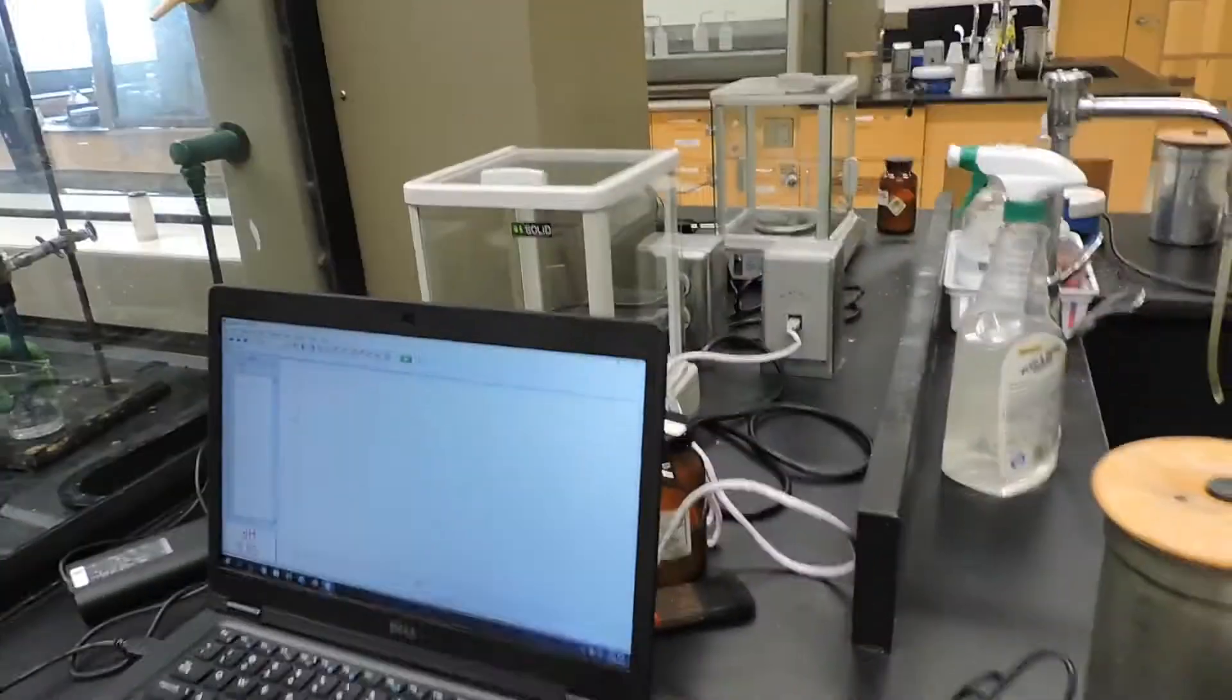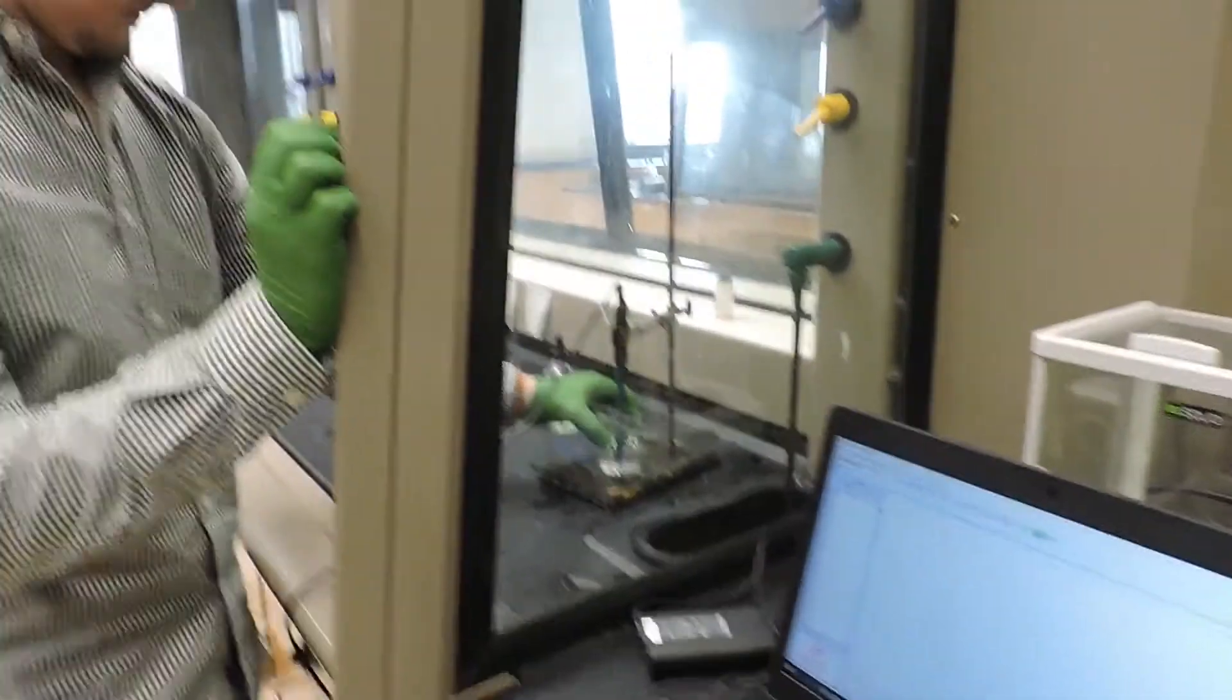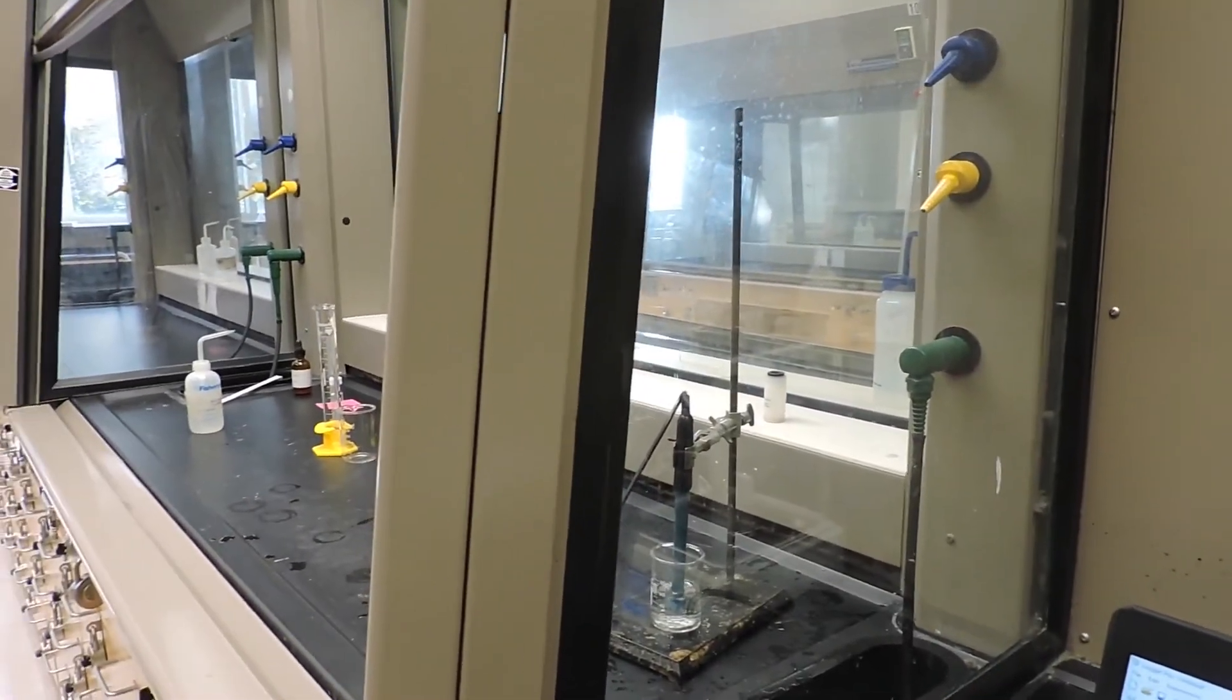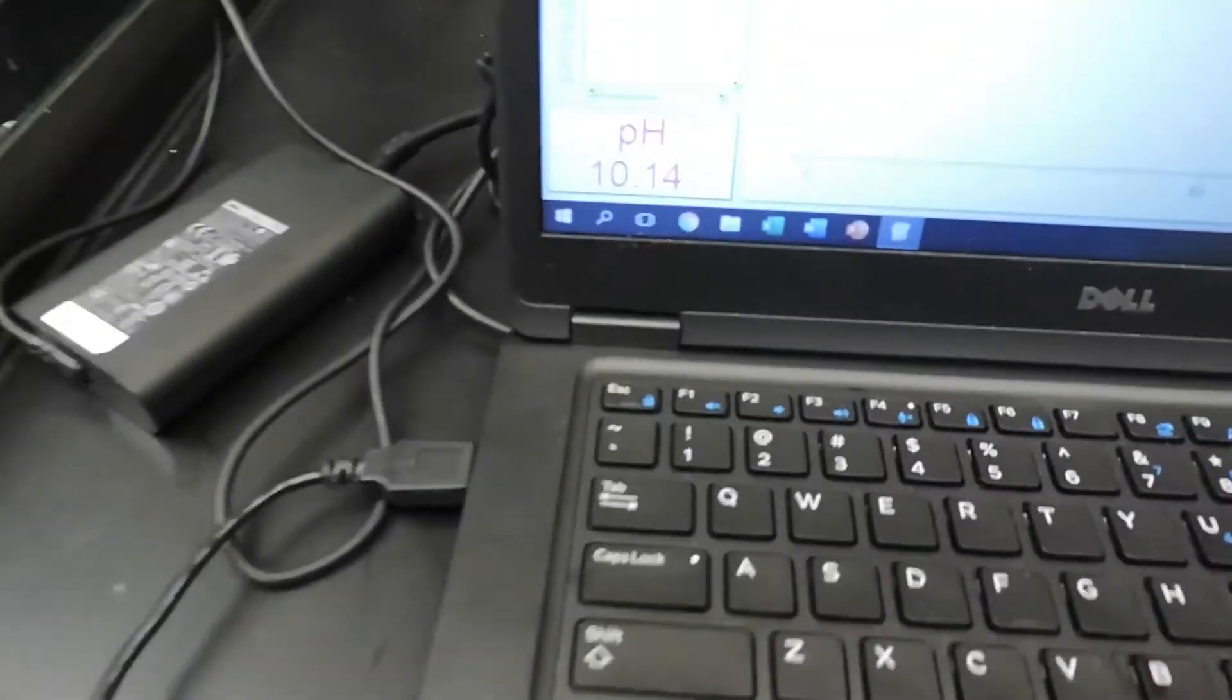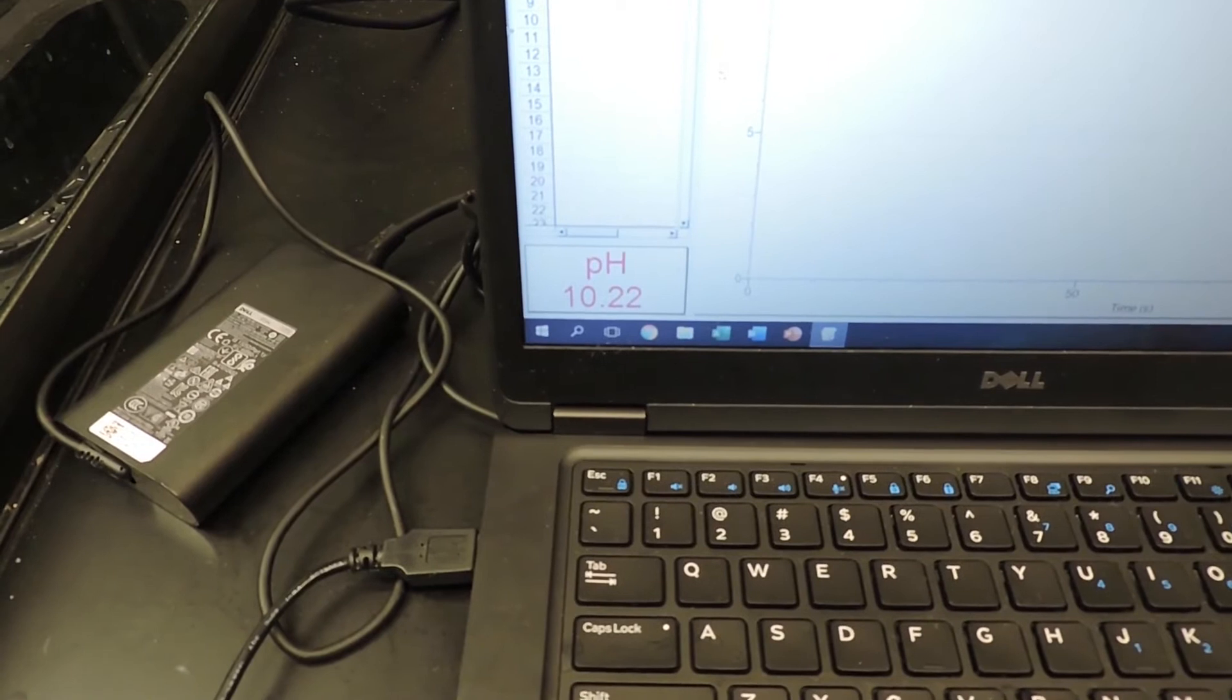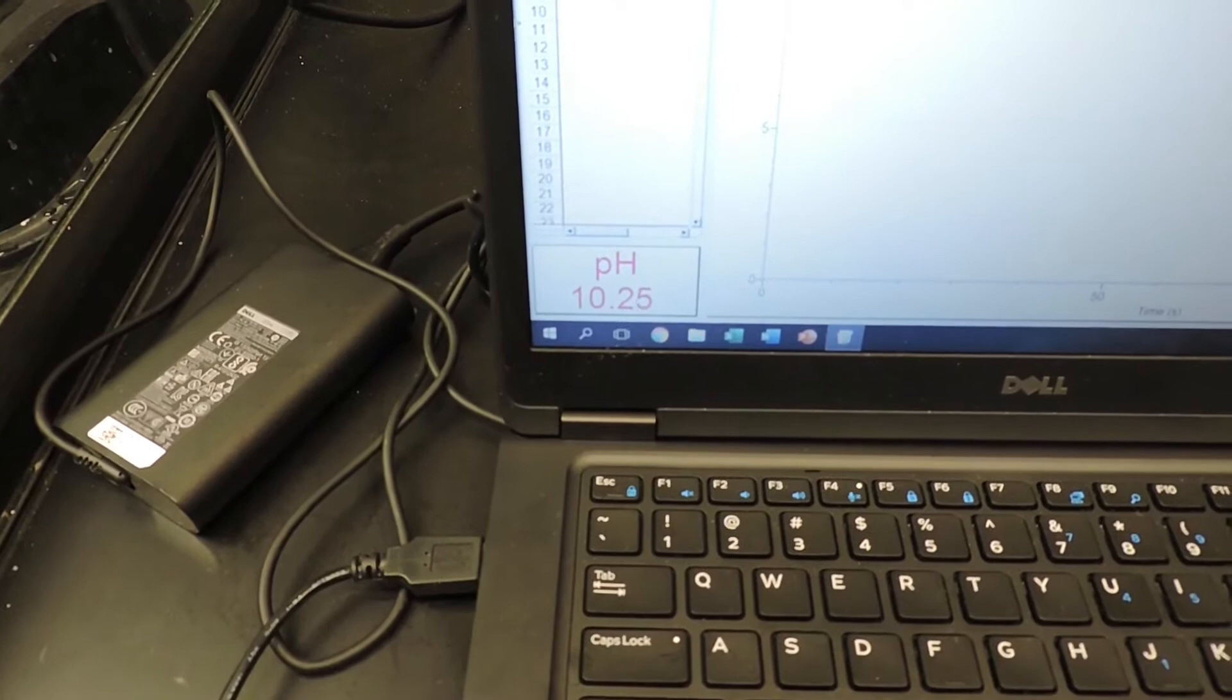Next, we're going to add one drop of the 0.1 molar NaOH and see what the pH is now that we've added that. Did you add it already? So Jared's already added it, so we're going to see what the pH is. We're now at 10.25.